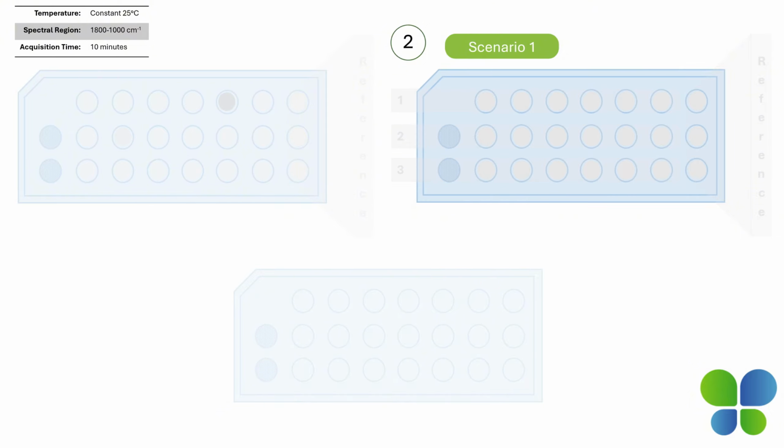The varying formulation conditions may include the preclinical candidate concentration, the excipients, or other formulation factors to examine their role in promoting conformational, colloidal, and thermal stability of the lead candidates. This row of septuplet sample conditions for the same candidate allows for a comparability assessment.